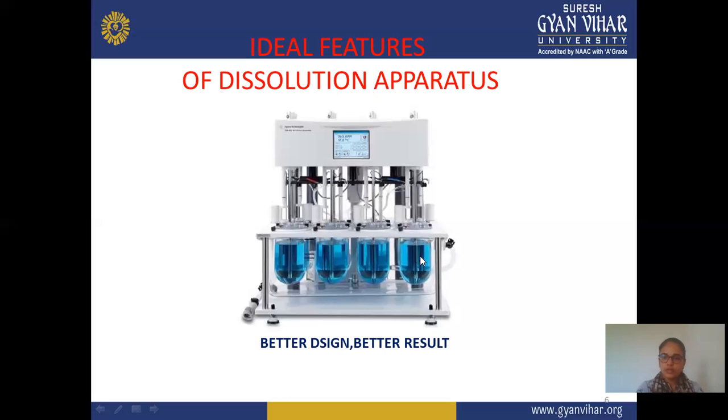After a particular time interval, according to the type of formulation, maybe 10 minutes or 30 minutes, you withdraw a sample from here. Suppose you withdraw 1 ml or 10 ml; you then add the same amount of fresh buffer to the solution. Maintaining this condition is known as sink condition. So you should maintain sink condition in this apparatus. So these are all the parts of the dissolution apparatus. Now we perform the test or study.